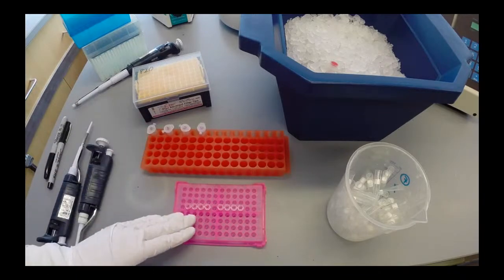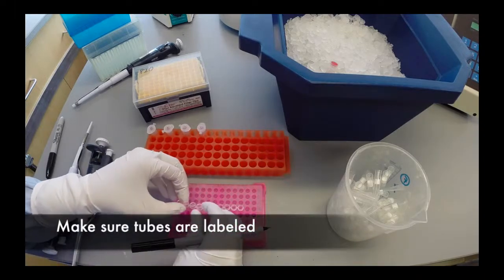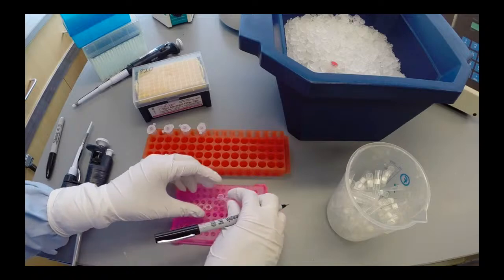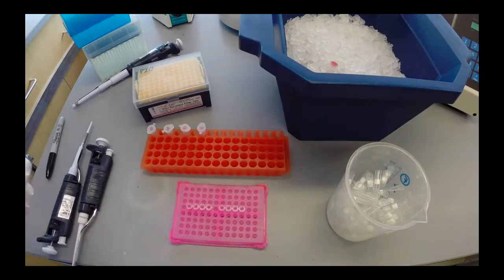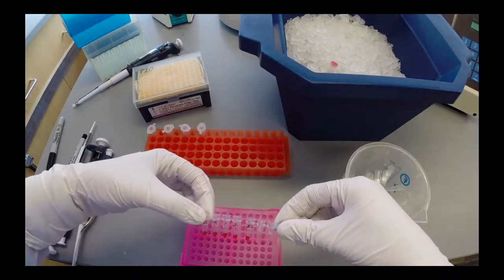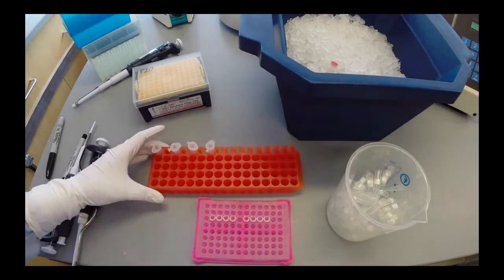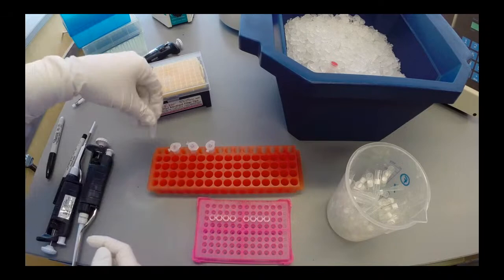Before adding DNA to the PCR reactions, make sure that the tubes are labeled. Make sure all DNA samples are mixed before transferring the solution.